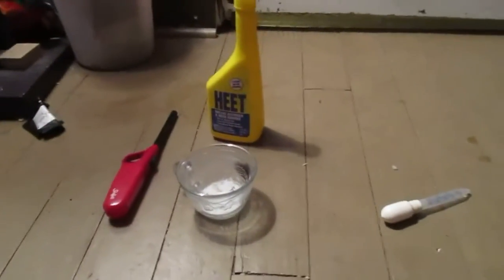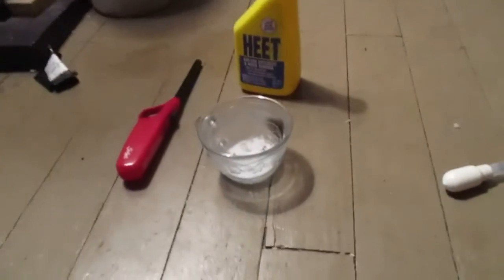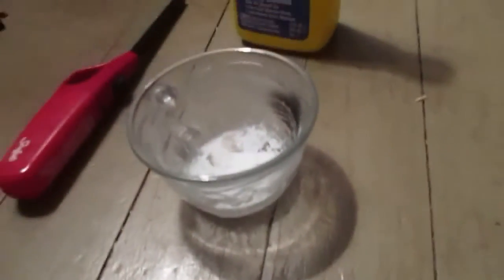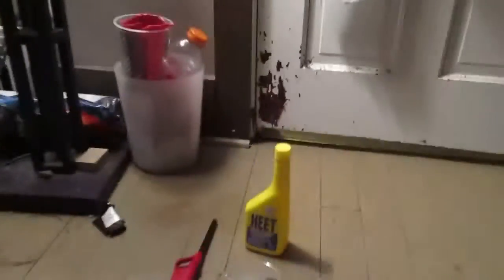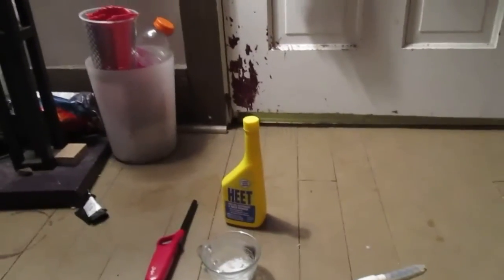What is up guys, the real Damon Jackson here. Today I'm trying a different camera, so I'll see how that works out. I'm going to show you what lithium ions look like, and it looks a lot different than regular fire.